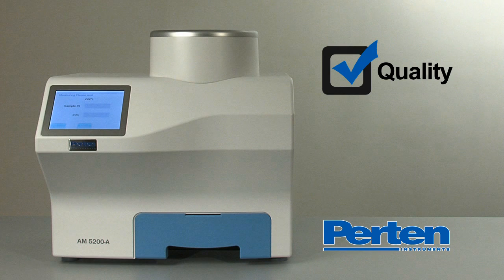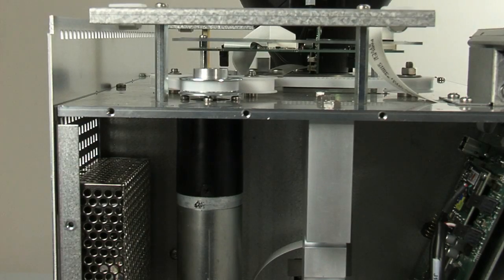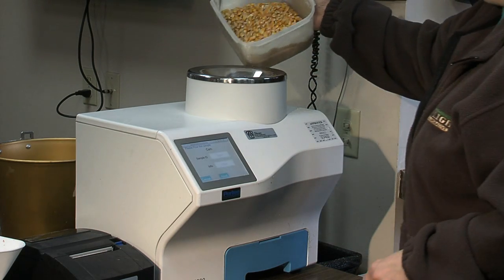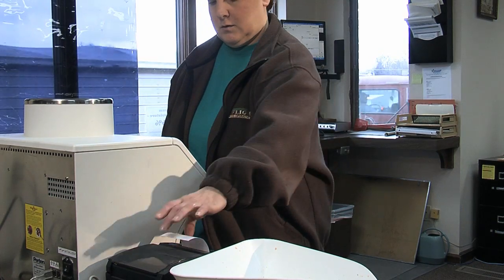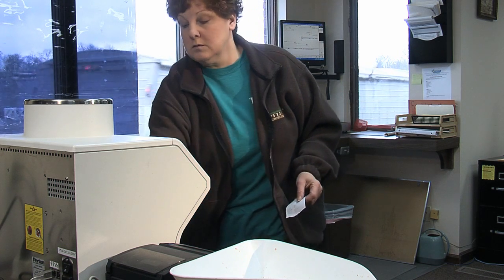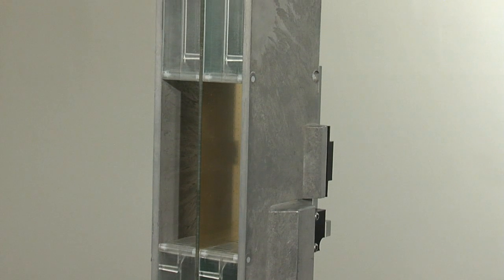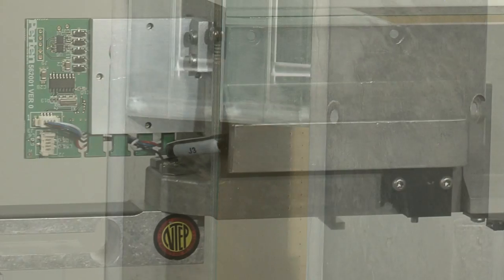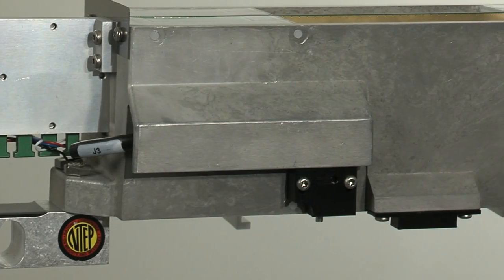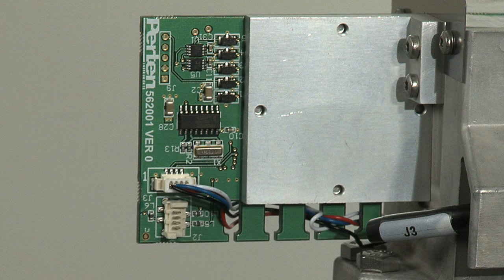The quality is rock solid. Just lift the Purtin AM5200A — 45 pounds of strong structural framework designed to stand up to long hours and many years of use in the harsh, fast-paced environment of a busy grain receivable station. The heart of the AM5200A is a single-piece cast aluminum cell, ensuring accurate, precise manufacturing, resulting in accurate, reproducible measurements of volume and density across all instruments. The PC board is integrated into the cell, removing problems caused by cables and connectors.